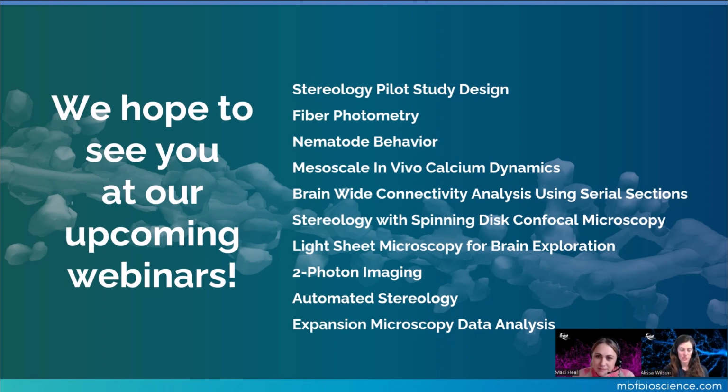in NeuroInfo, you are using the cell detection workflow. So you're just getting a heat map of what is going on within your image data. You'll be able to see concentrated markers. Whereas with Stereo Investigator, you are using stereology and getting an estimate of the total number of cells within that region.